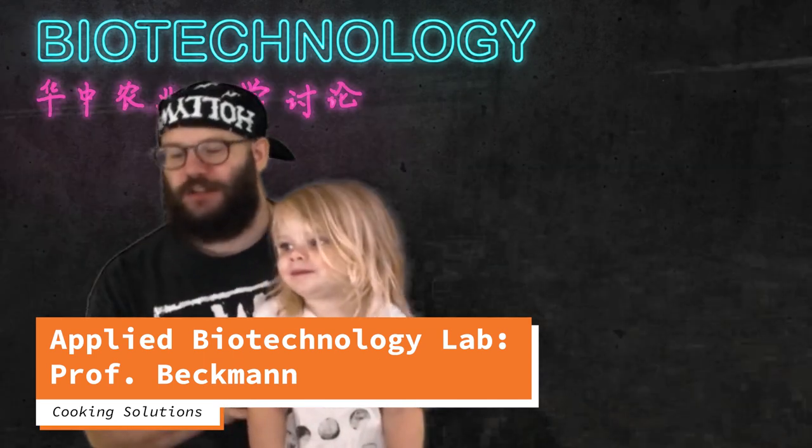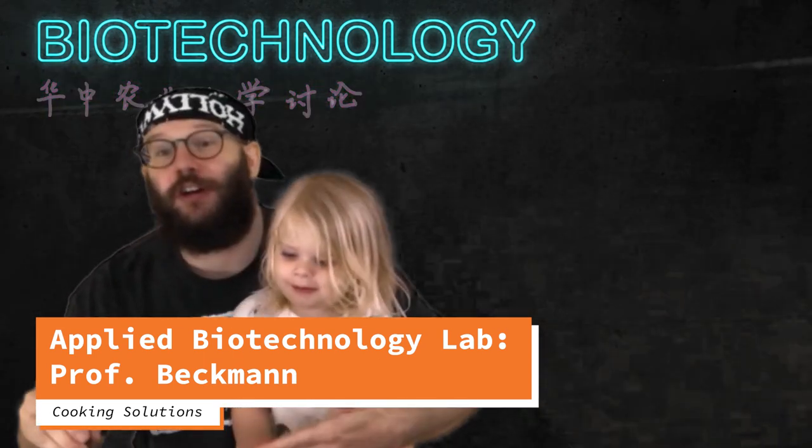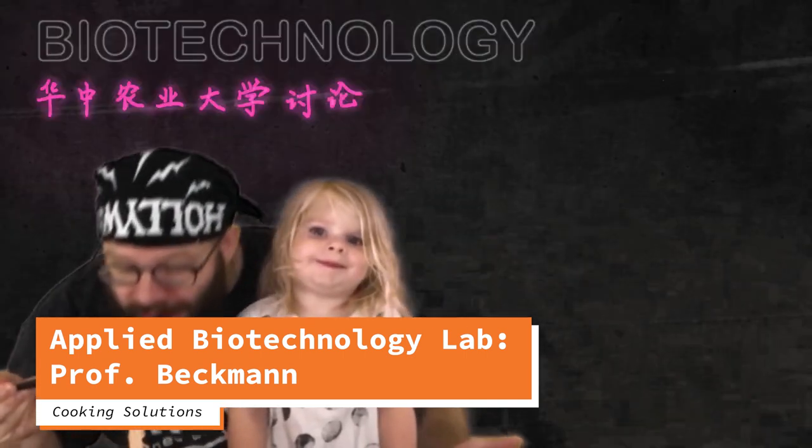Working in the lab, some of the first things that you're gonna do is to cook. You're gonna cook solutions.